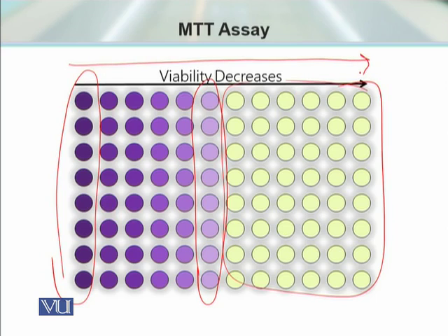And by this means we can proceed further to calculate the number of viable cells which we are going to use for subsequent research experiments.